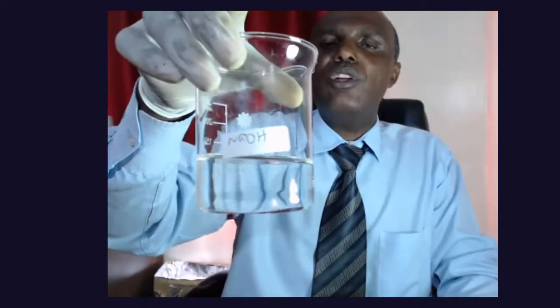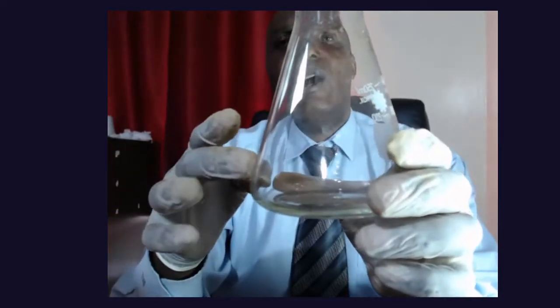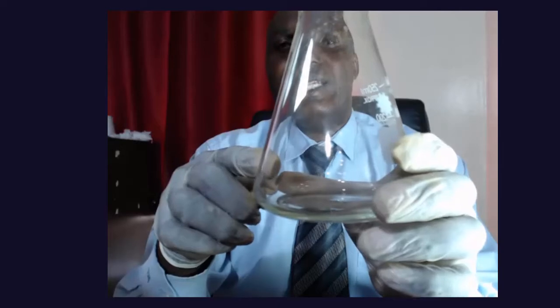We are going to react those two solutions, and the process of reacting them will involve putting one solution in a conical flask. This is a conical flask, and we are going to place sodium hydroxide here. Then we will put an indicator.